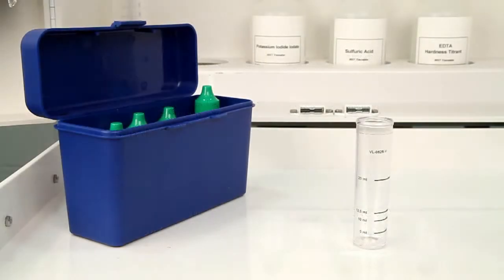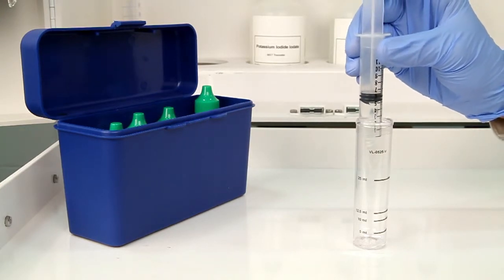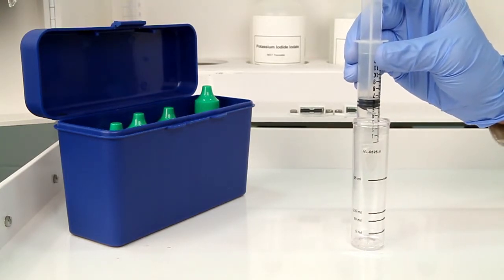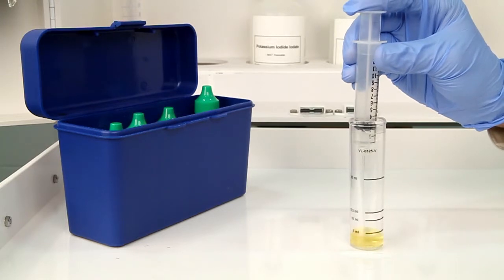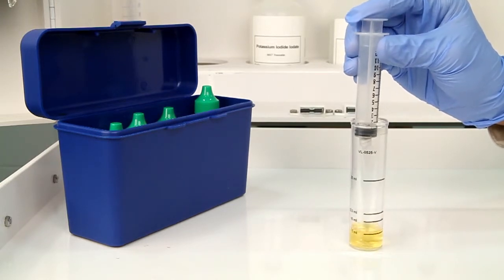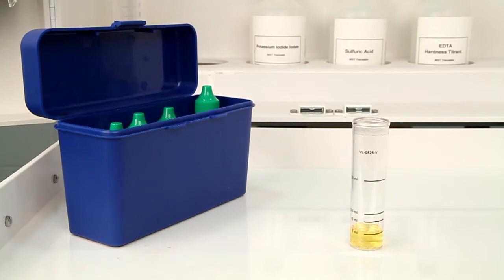Use the syringe to accurately measure your sample and then add the sample to the vial. A yellow color indicates available chlorine dioxide. Swirl the vial to mix.